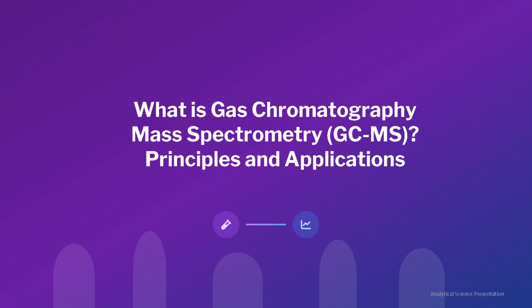What is gas chromatography mass spectrometry, GC-MS? Every sample tells a story, and often that story is hidden inside tiny peaks on a chromatogram. Gas chromatography mass spectrometry, or GC-MS, is the tool that allows us to unlock those stories, revealing the molecular identity of even the smallest traces of chemicals. In this session, we'll explore how GC-MS separates, identifies, and confirms compounds with powerful precision, and why it remains one of the most valuable analytical tools across modern science.